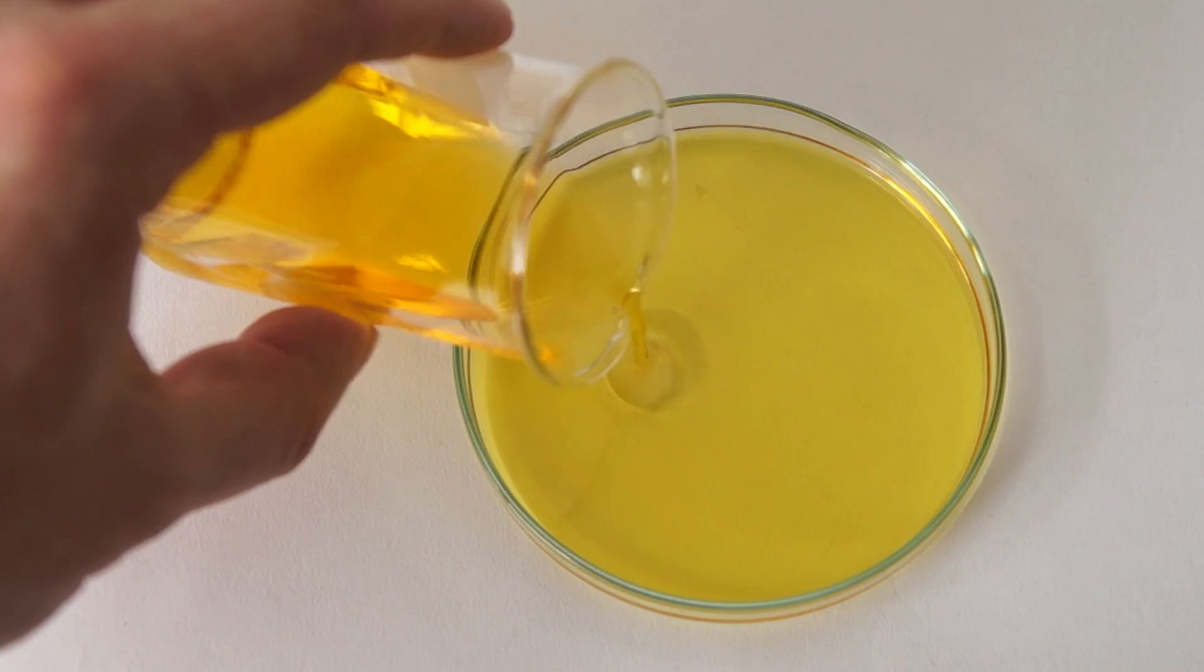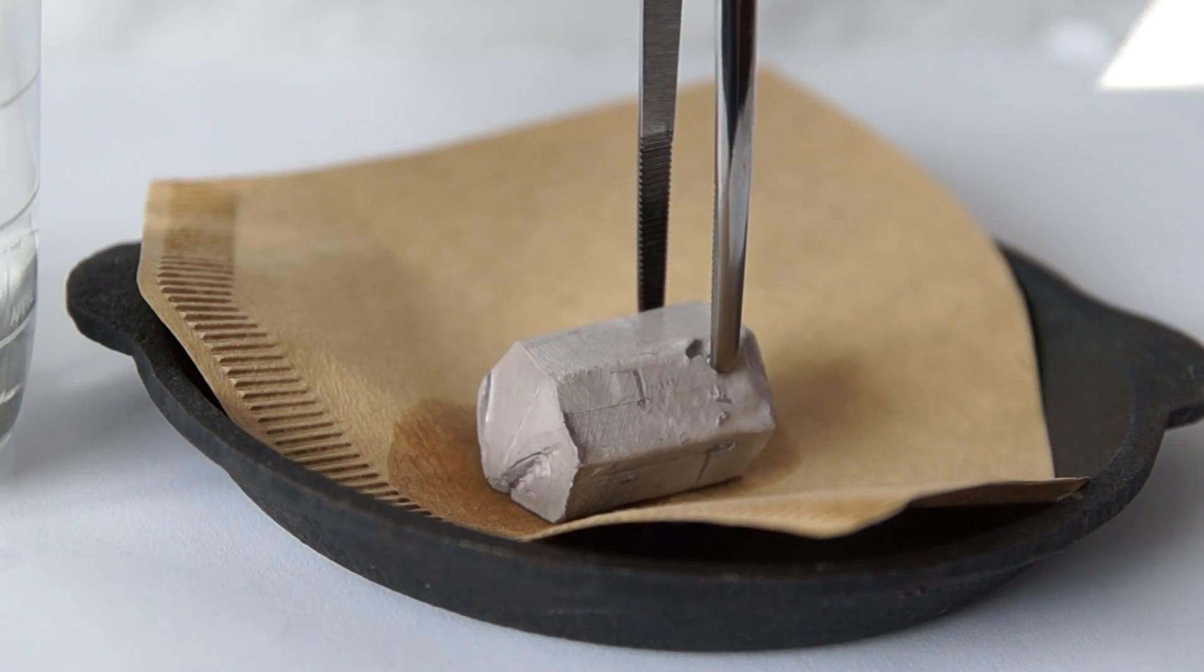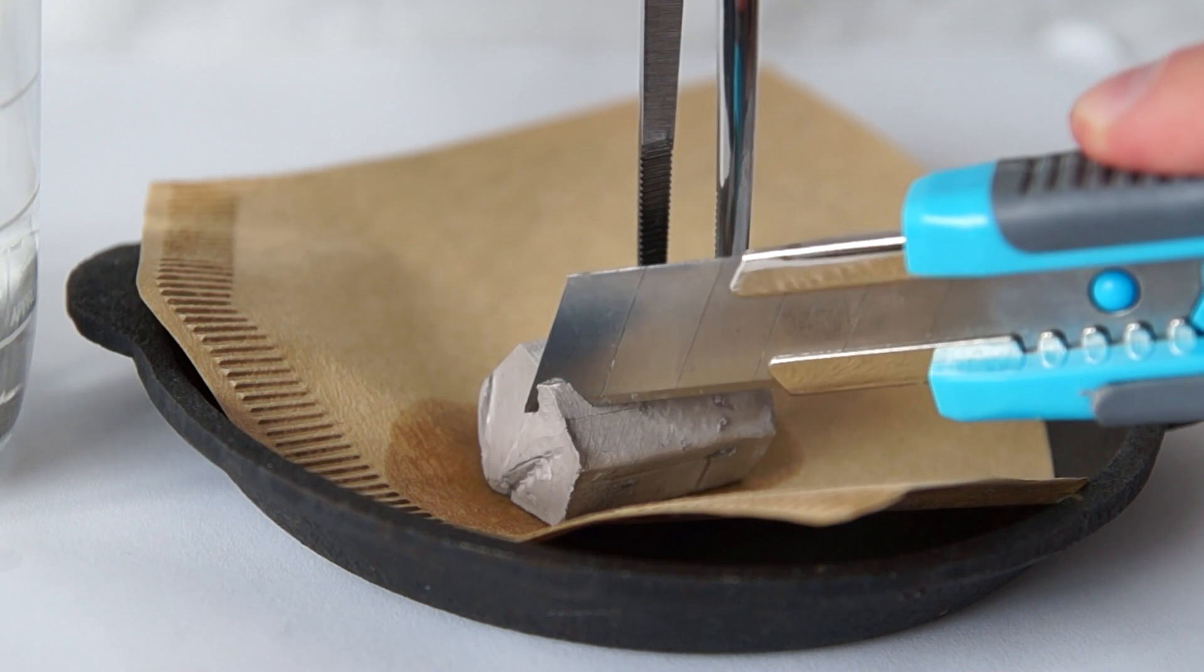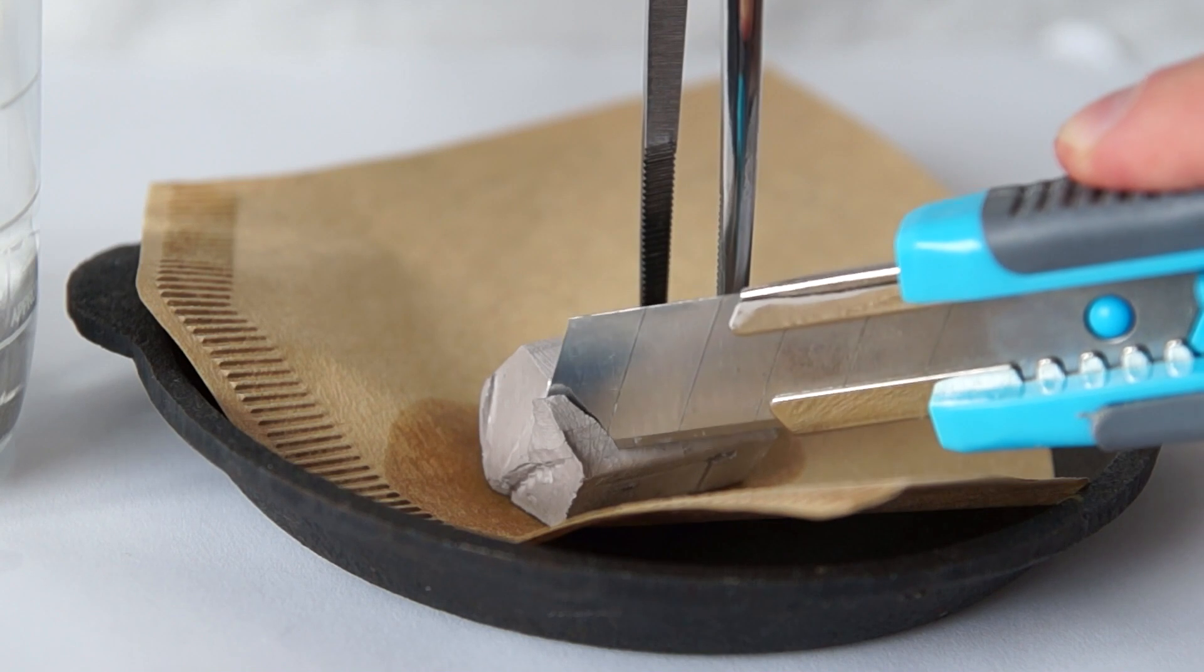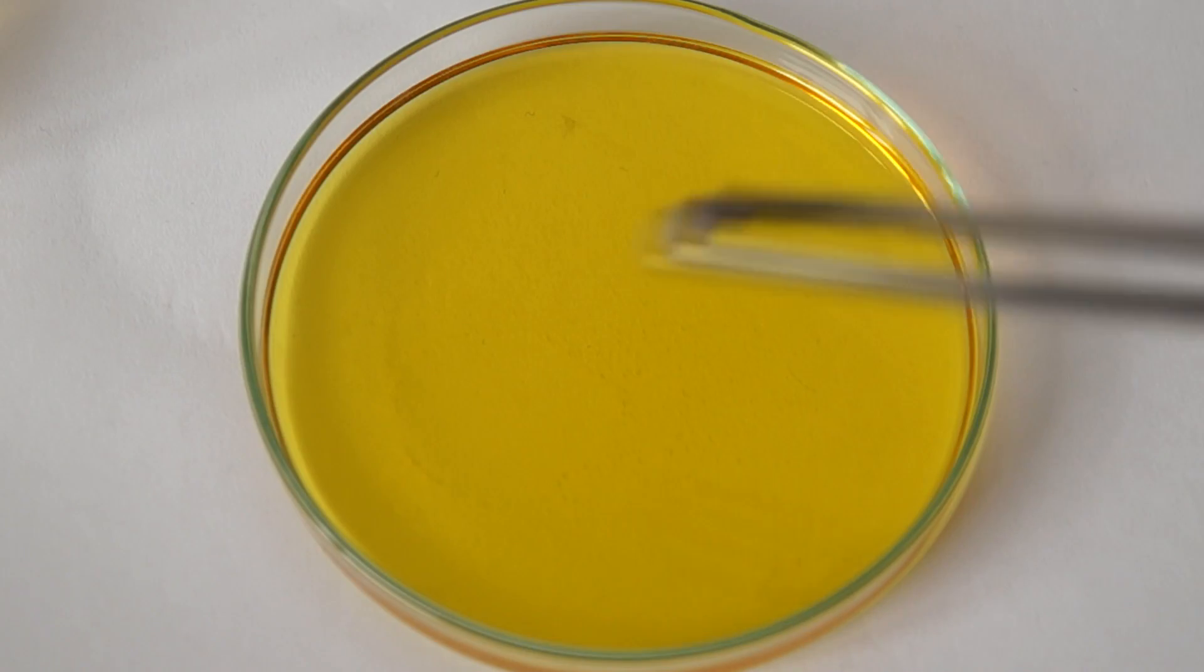Now let's put the resulting indicator mixture into a petri dish. For our experiment we'll also need metallic sodium. Sodium is an active alkali metal, so take a small piece of sodium and cut it into smaller pieces.